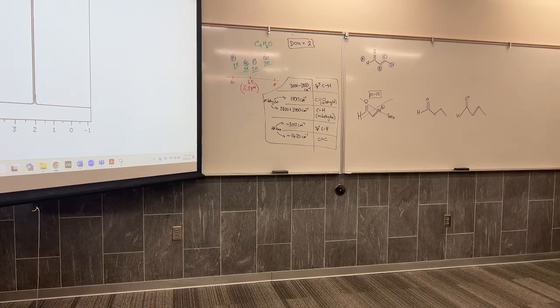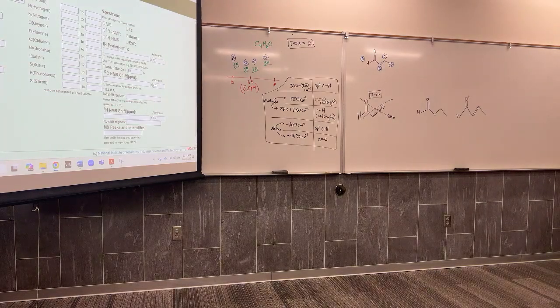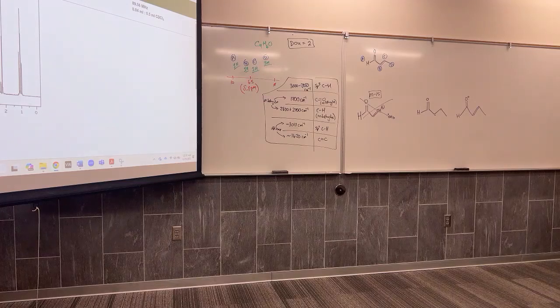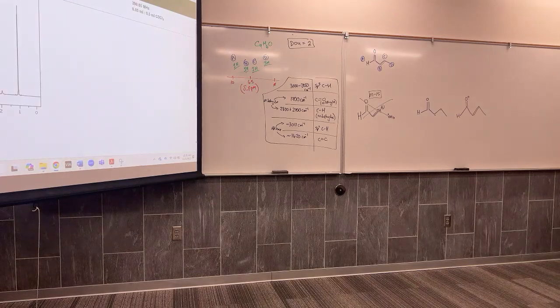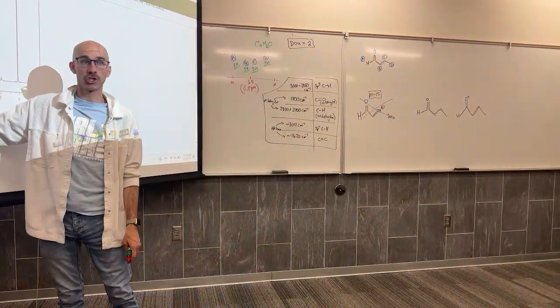What I want to revisit with you guys is an odd aspect of OH and NH bonds in the NMR. So this is a compound called diethylamine. Well, that's not fair. Sorry, I guess they don't have the NMR for it. I should be able to give you this. This is a compound that has an NH bond. That hydrogen shows up in the NMR.